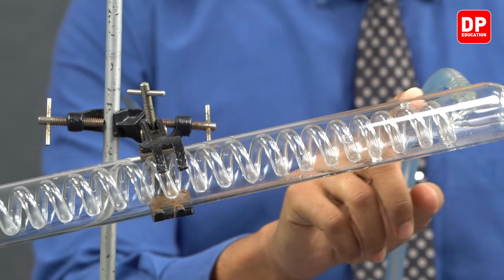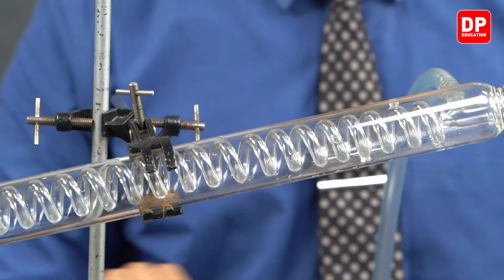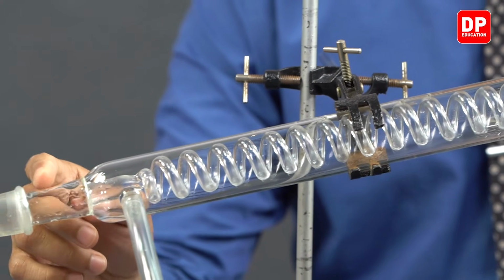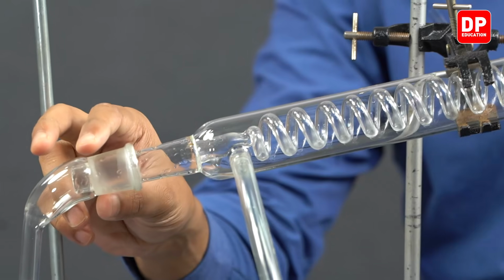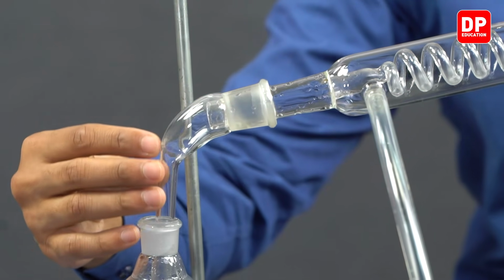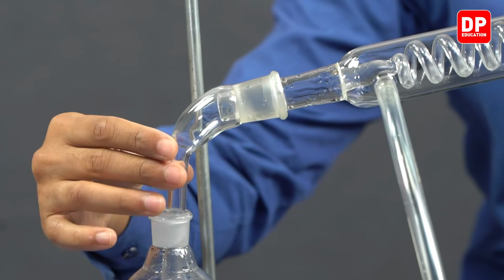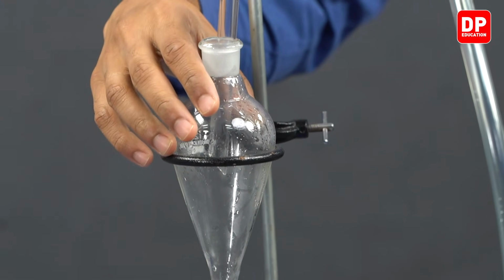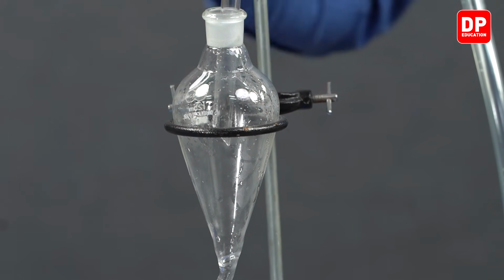This spiraling glass tube will carry the vapor mixture all the way till the end of the condenser, and it is going to be connected to this bent distill adapter, and the bent distill adapter will be directing that vapor into this separatory flask that we have over here.